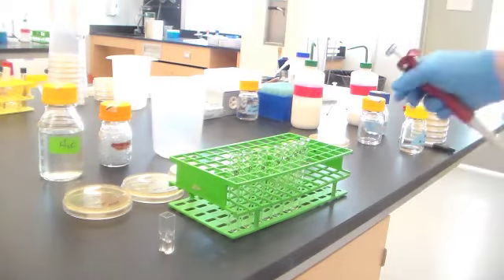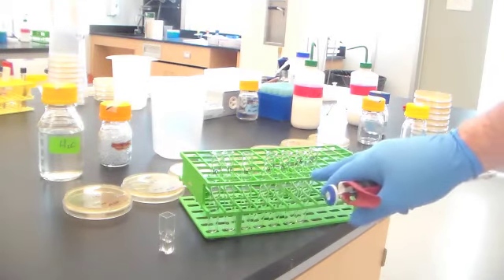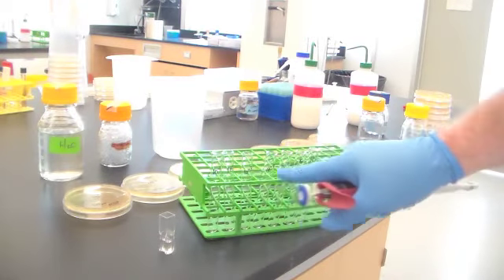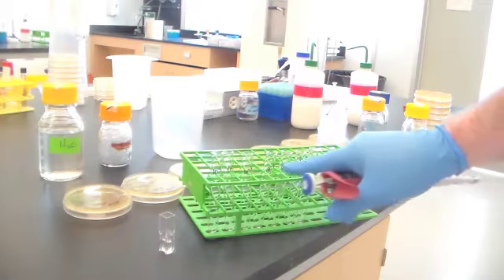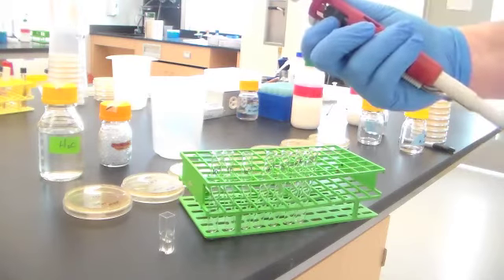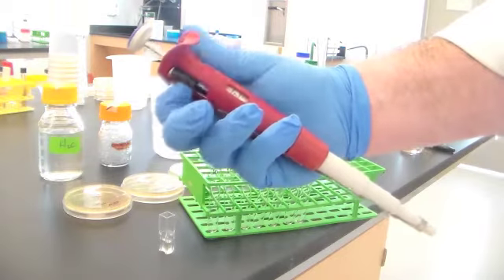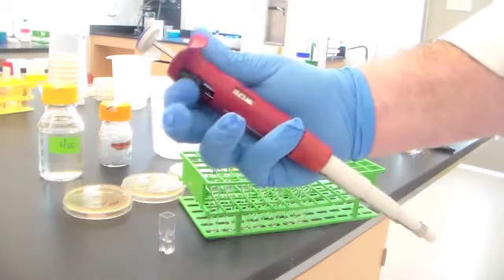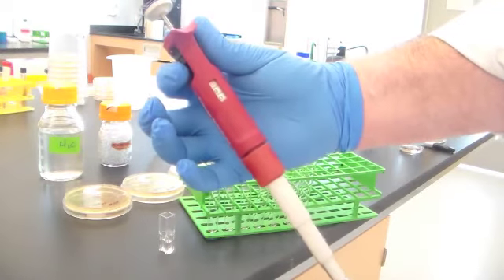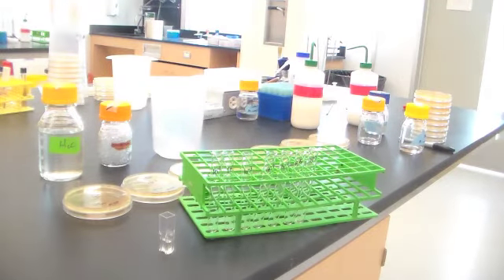And I'm going to set up a serial tenfold dilution. So what I've done is I've taken 7 sterile glass tubes, and I've labeled them 10 to the minus 1 through 10 to the minus 7, reflecting the dilution series that I'm going to do here. The next thing that I'm going to do is set the pipettor to 9/10 of a mil, 900 microliters. So 0 in red, and then 90 is 0.9 mils, or 900 microliters.